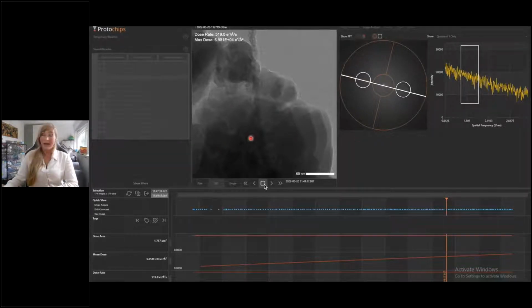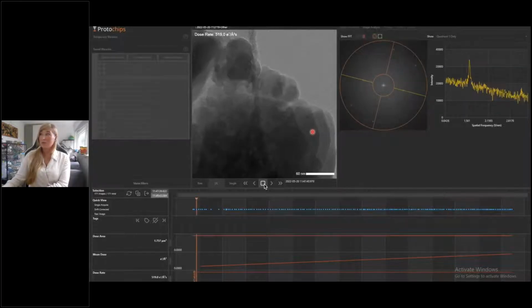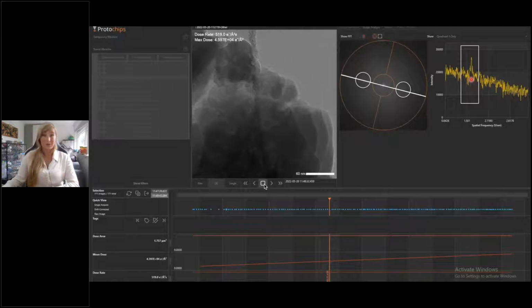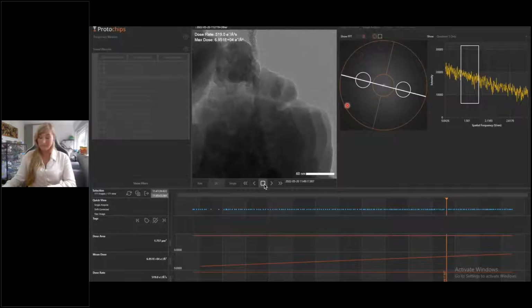If we now, after only 1.5 minutes, would want to try and do a reaction that needs this crystallinity of the zeolite, we wouldn't see much happening, just because we've been on this zeolite with our beam a lot, and because we've lost our entire crystallinity in the meantime. So dose is extremely important, also already in vacuum.